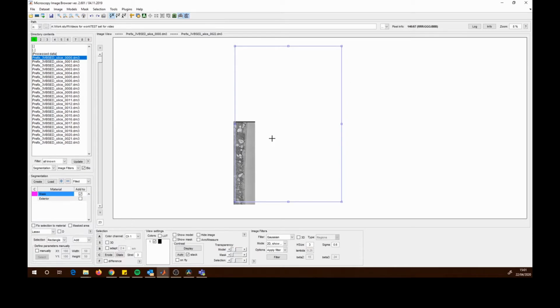What you'll see as well is the graph that we had before will not look like a jagged line with, say, a kind of random noise movement. It will look like a step, so it will just be a line and then a massive step, then another line. On the bottom axis, it shows you which frame it was up to.